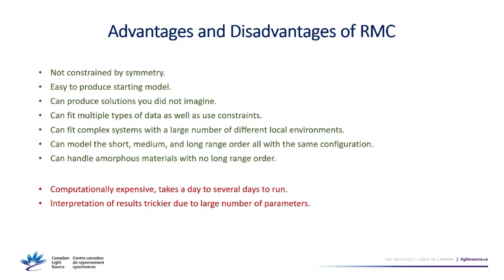Yes, basically. I should mention there's a lot of constraints in here. Like there's a maximum atom move, usually only a few hundredths of an angstrom it can move in one step. So it's not jumping all the way across the giant cell. So you have maximum atom moves, and you have minimum atom-atom distances. They can't get too close and they can't move too far at once. So basically they're all going to stay in their coordination sphere more or less. They can't drift too far away. So that keeps it from going too crazy.